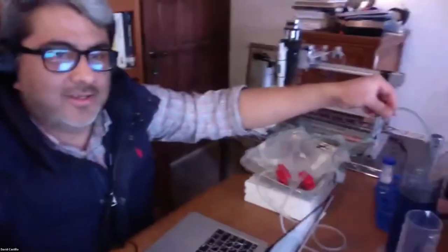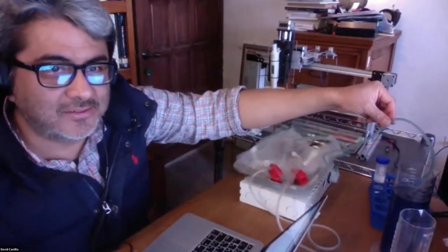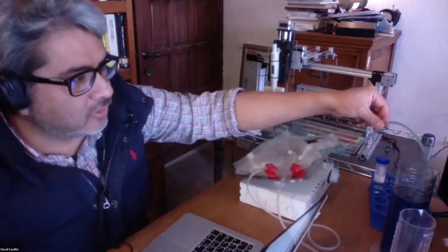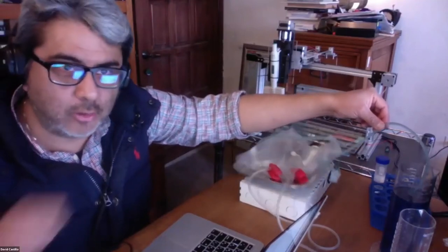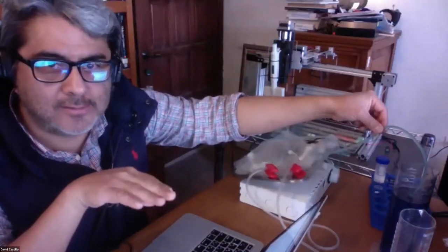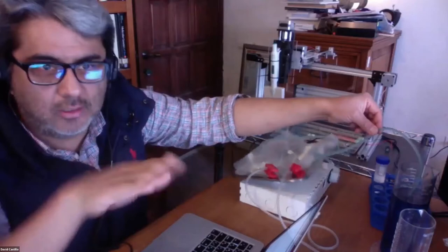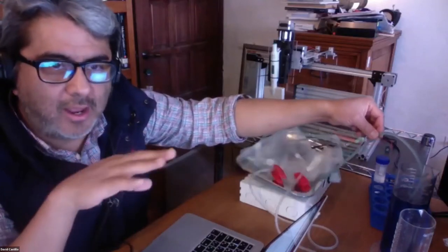Okay, here it goes. And I don't know if you can see how it's pumping. Okay, one second. How it's pumping and then it's delivering to the bag. Okay. So we also are capable of controlling the temperature and also adding some logs. Like for example, if you want to test a different type of strain, you can check the temperature, you can check the rocking speed. Well, we're still working on that.